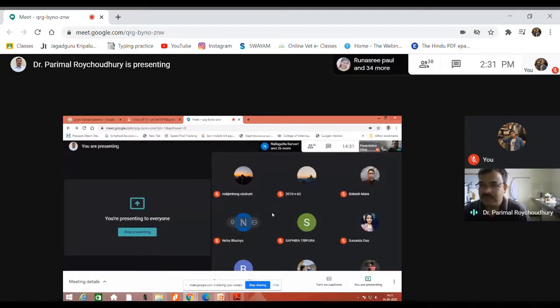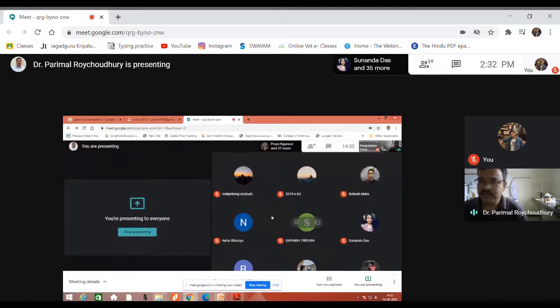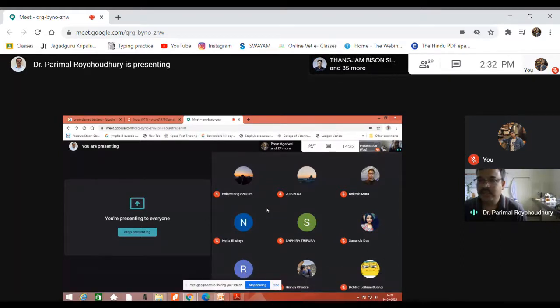You know about Gram staining, which can differentiate broadly all the bacteria into Gram positive and Gram negative. Similarly, we have a differential stain to demonstrate a special kind of bacteria causing tuberculosis in man and animal. It's the Mycobacterium species, which usually cannot be demonstrated by Gram staining, so we use the alternative acid fast staining. So these are the two classical examples of differential staining. Of course, we have many other differential stains, but most commonly we use these two.